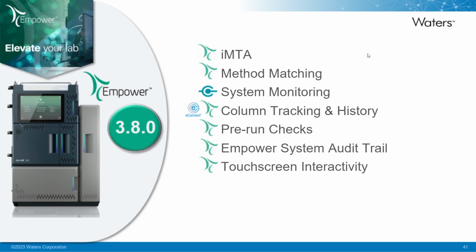So here's a couple of scenarios. I go into the laboratory, I install a column into the HPLC. It's not the correct column that the method calls for. I start running, somebody realizes, or maybe it's at the end of the day after all the samples have been run, I've got the wrong column. Now we can't use any of the day's work. Wouldn't it be nice if we had a system by which you install the column, you tell the system to start the sample set, it does a quick check to make sure you've got the right column installed as per the method. If it's wrong, it doesn't run the sample set and you get an error message. It's things like that.